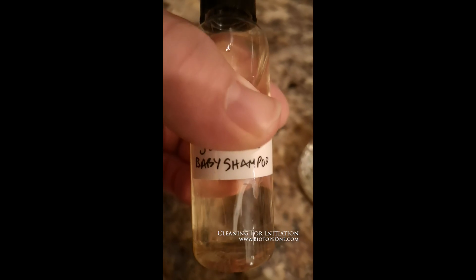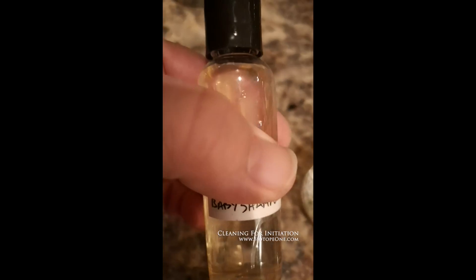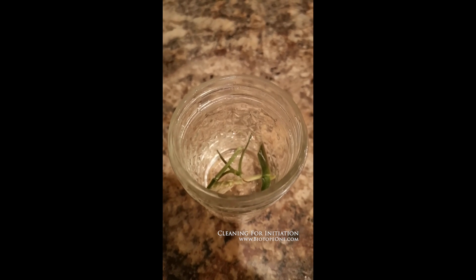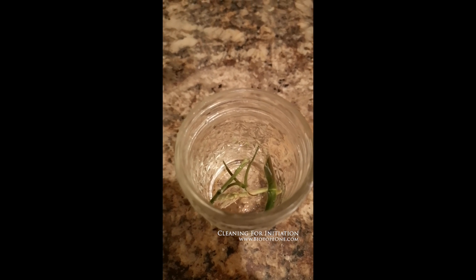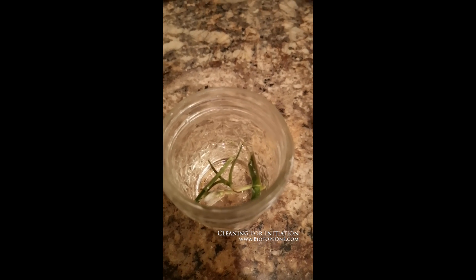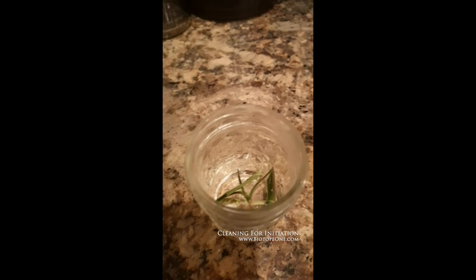I've rinsed off my explants for about five minutes and I'm going to use baby shampoo as a surfactant — it helps clean better if you use some kind of detergent shampoo. Johnson's is pretty mild; any of the baby shampoos will work. I've used Dawn but I seem to have a little better livability with baby shampoo. I'm just going to add a couple of drops, and then I'm going to shake it for about five minutes, then rinse it some more before starting the bleach and hydrogen peroxide.